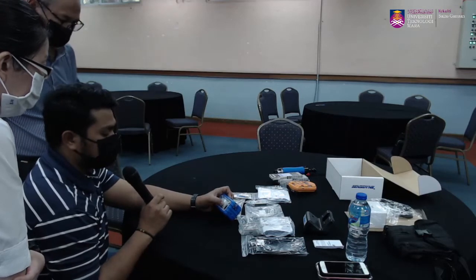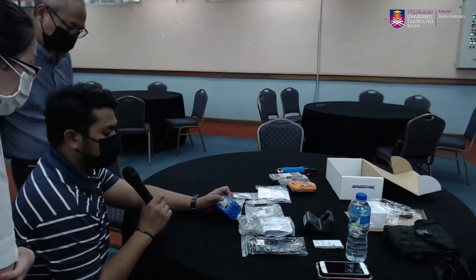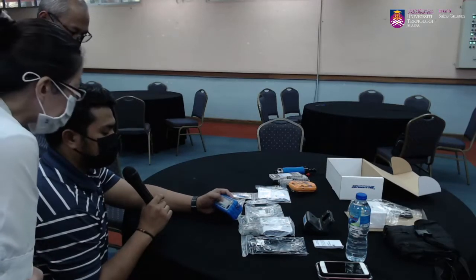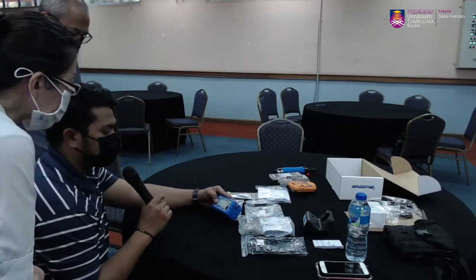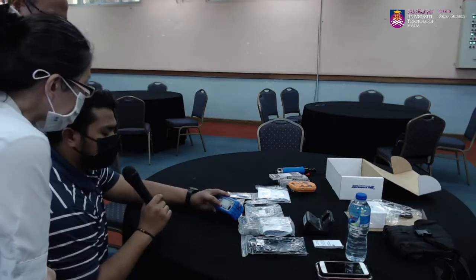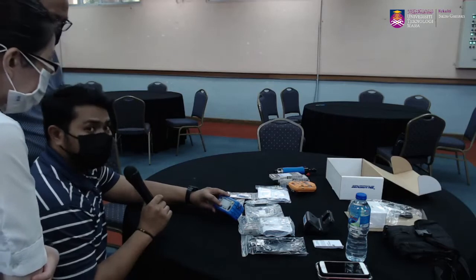Okay. So kalau macam tu kita still nampak arrow, means dia tak lock lagi lah. So kita just tekan enter. Okay. So once dia enter, hilang dah dia punya arrow tu, kita just boleh start the run lah. So currently kita boleh tengok kat bawah ni is high. High means that it's currently in high flow lah.